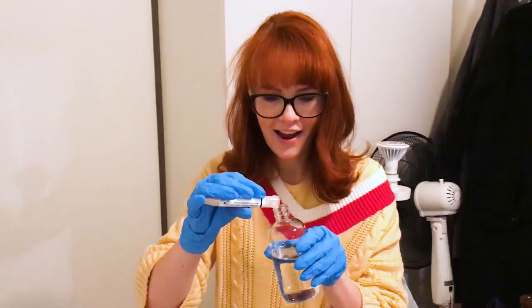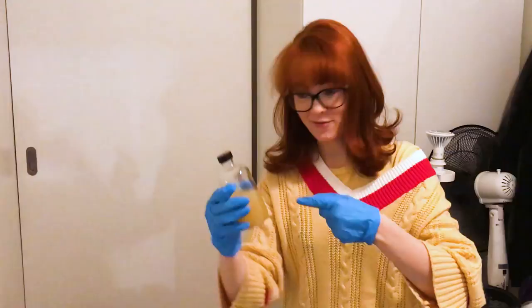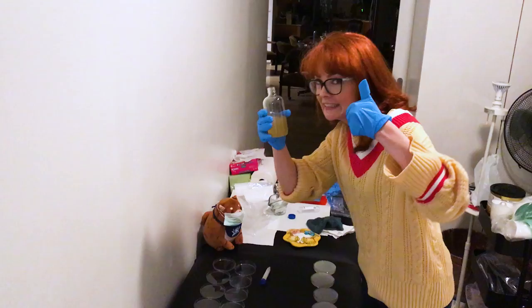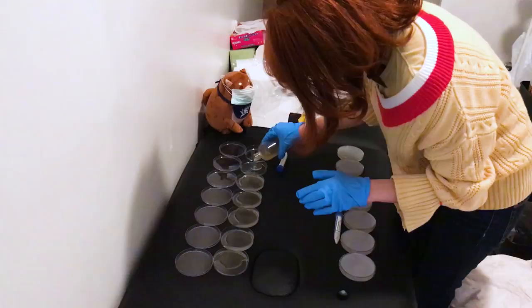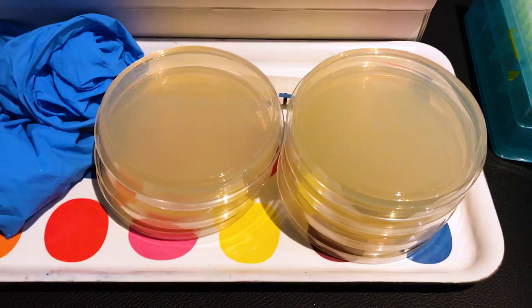First step is to create food for the bacteria. The food was a gelatinous substance called agar. Now we get a microwave. The agar was poured onto a bunch of different petri dishes to provide a nutrient source for the bacteria to grow on.